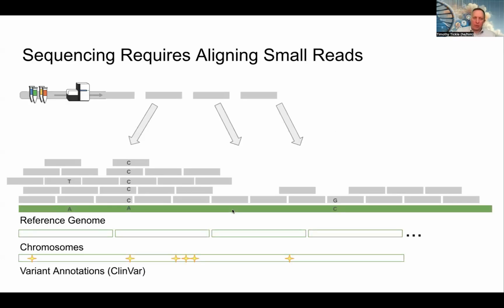First, a little context about what short read sequencing data is. One technique for understanding when you're analyzing DNA, for instance, in samples, is to use sequencing technologies. So up on the left-hand corner, you would have samples and you would run them through a sequencer. And what you get out of that are often these short sequences of DNA that were found in the sample. And so you have a whole bunch of these short sequences of DNA, and you have to be able to align them back to where they originally were.